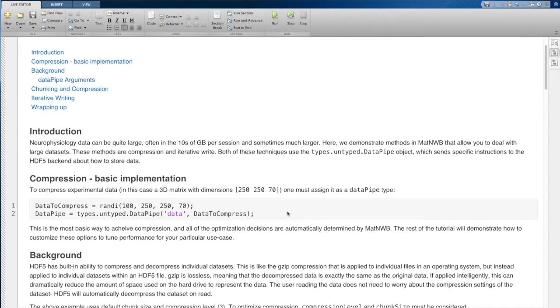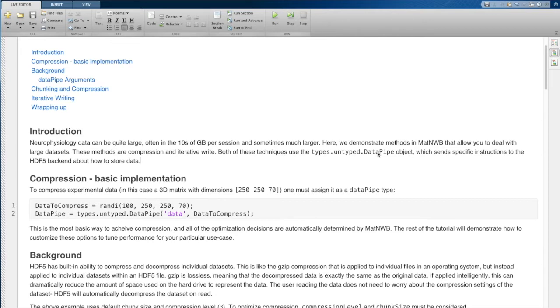The two main things that you might want to consider doing if you have really large data are compression and iterative write. Both of these techniques are going to use the types dot untyped dot data pipe object.